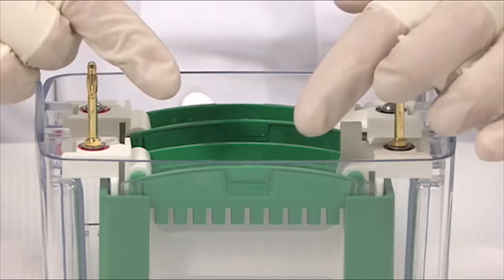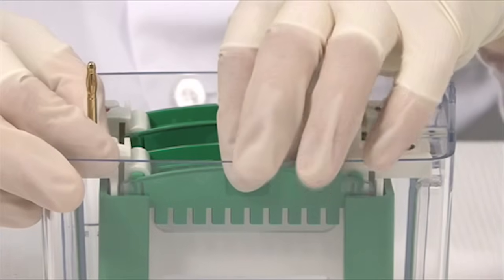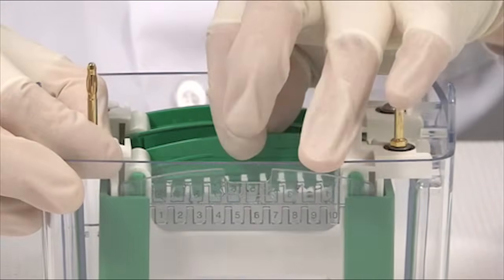Next you want to remove the comb from your TGX gel. Locate the notch in the middle of the cassette, grasp the comb from the center, and lift straight up and out.